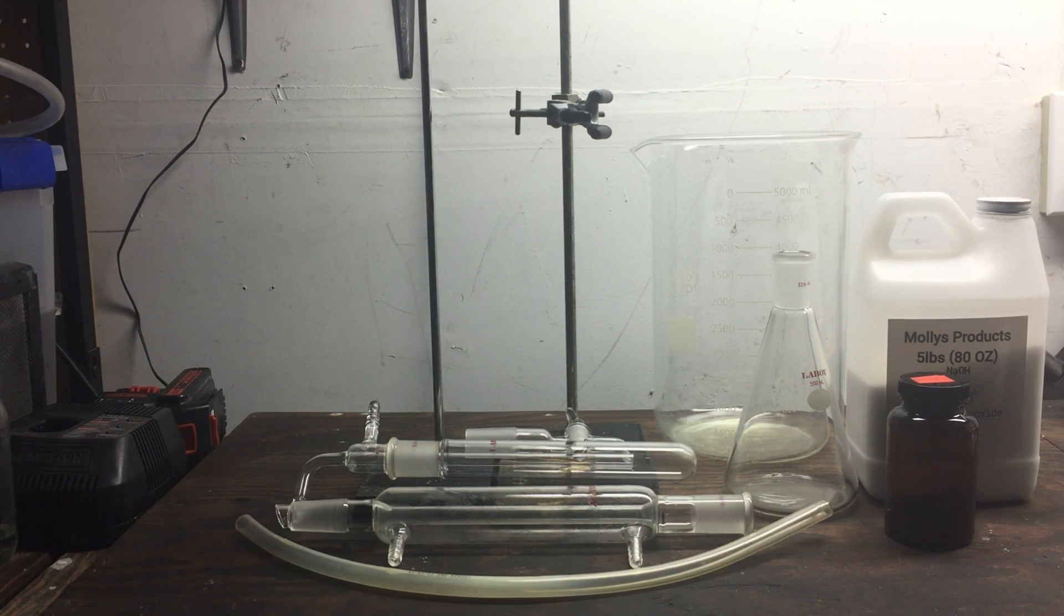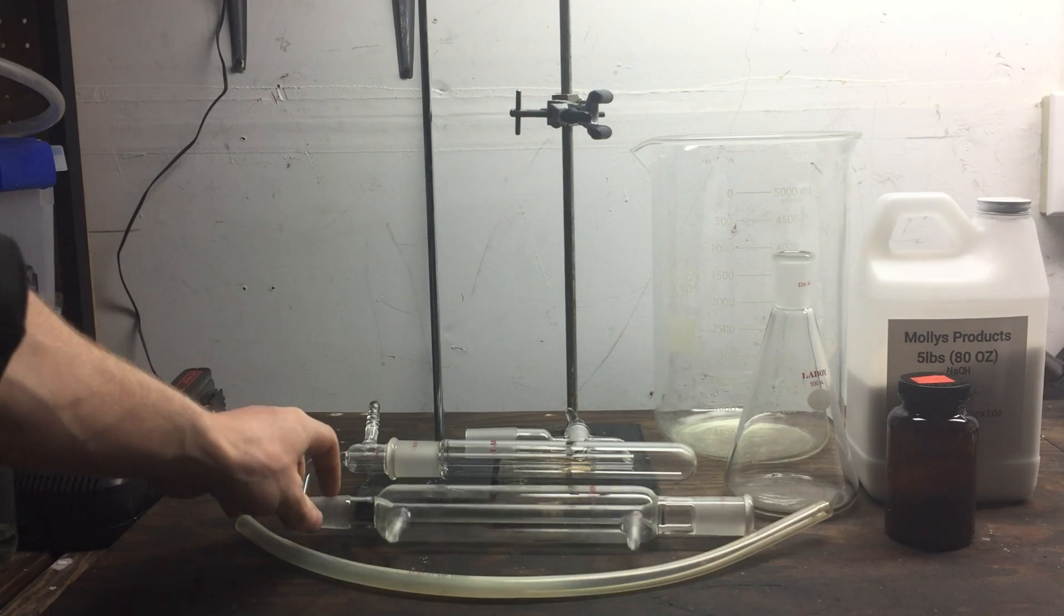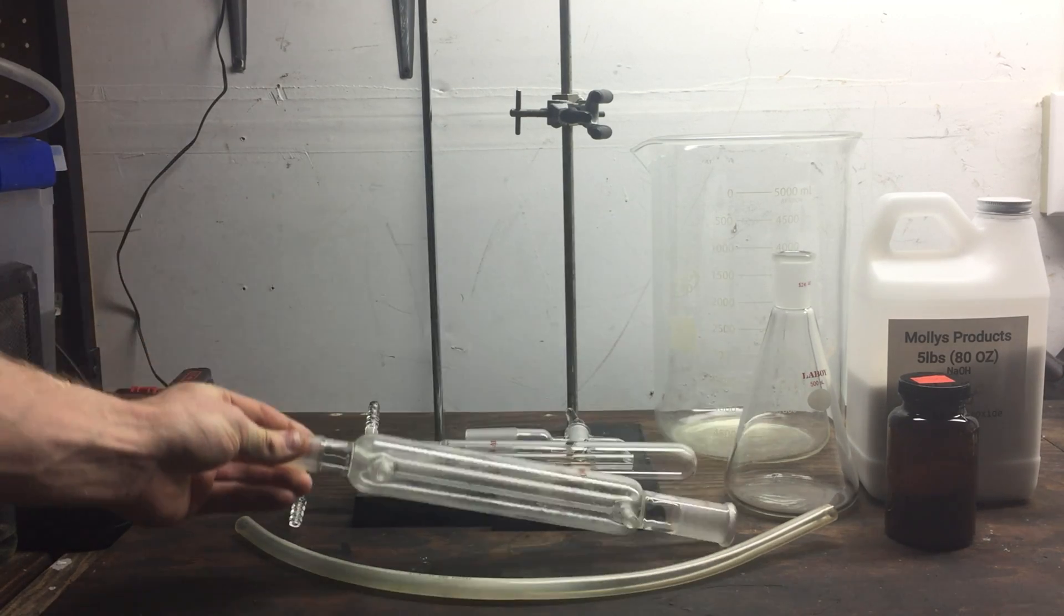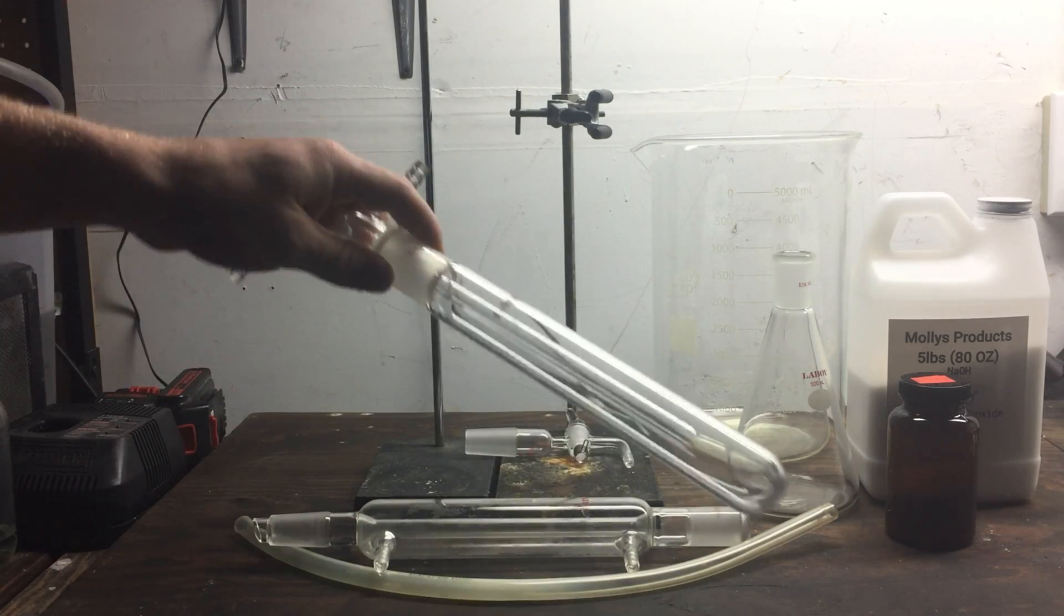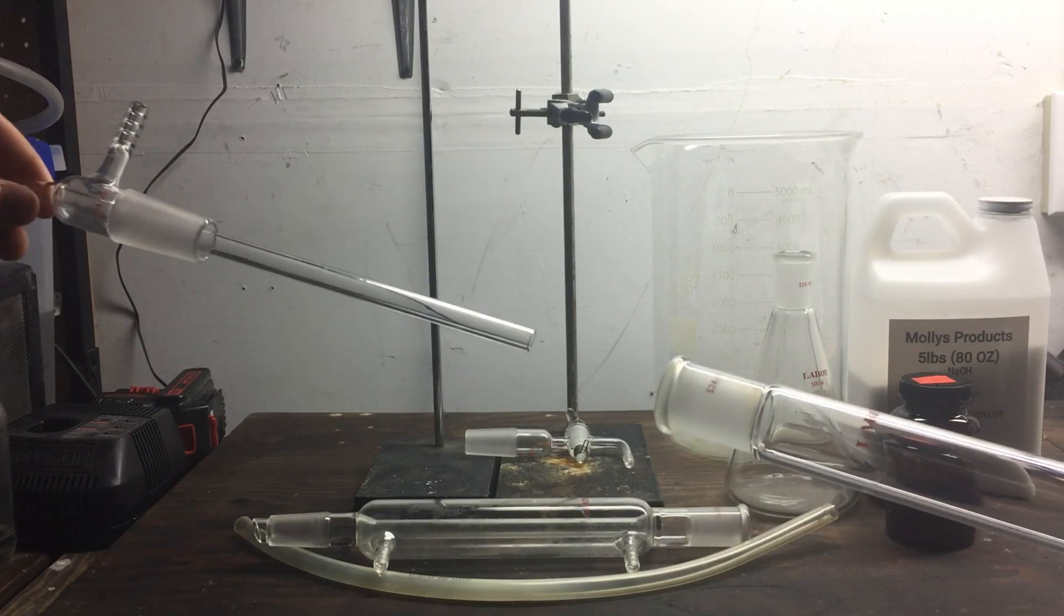With that said, here is the equipment I used in the experiment. I used my distillation column as a makeshift refluxing condenser. I used my gas washing bottle to collect the ammonia gas in solution.